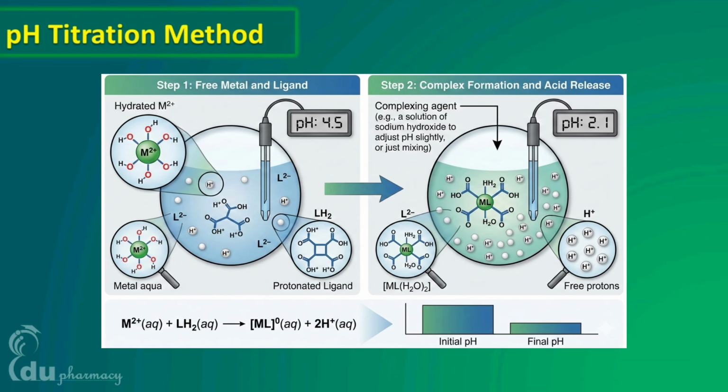So in this session, we will understand the principle behind the method, the experimental procedure, and finally, how to calculate the donor-acceptor ratio and the overall stability constant from the titration data.